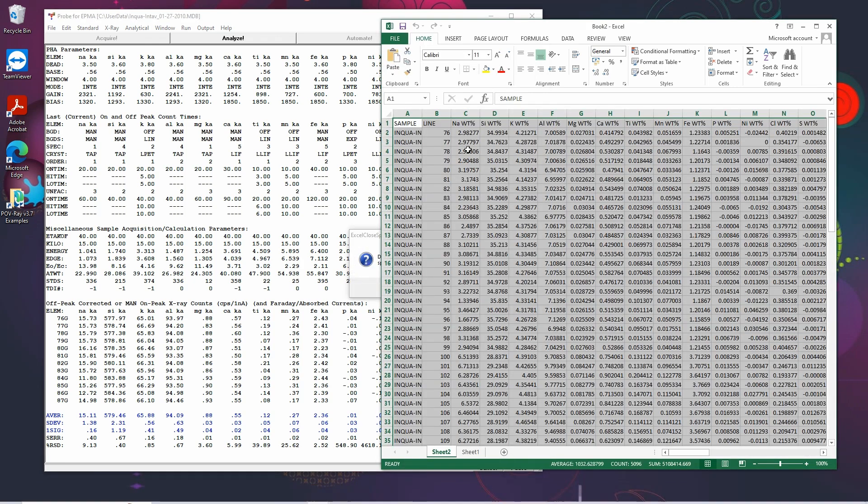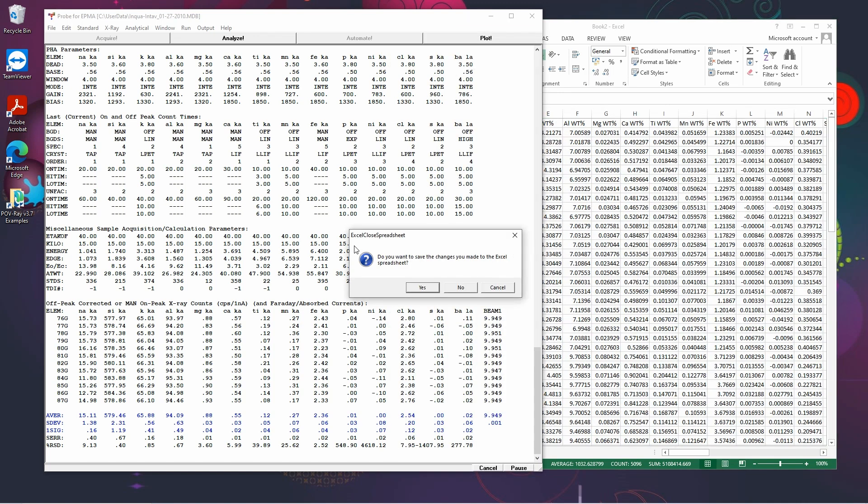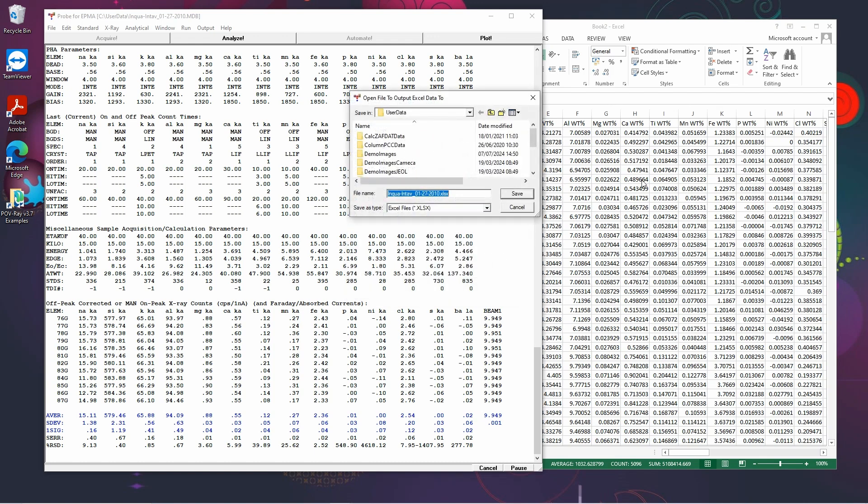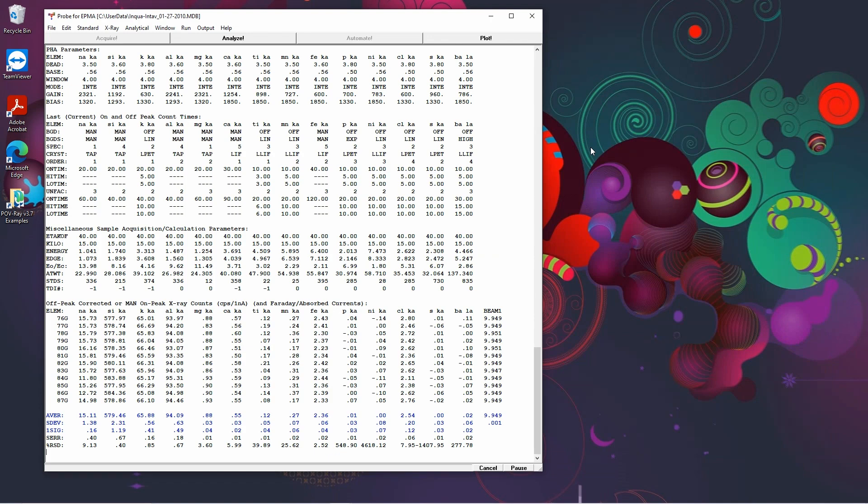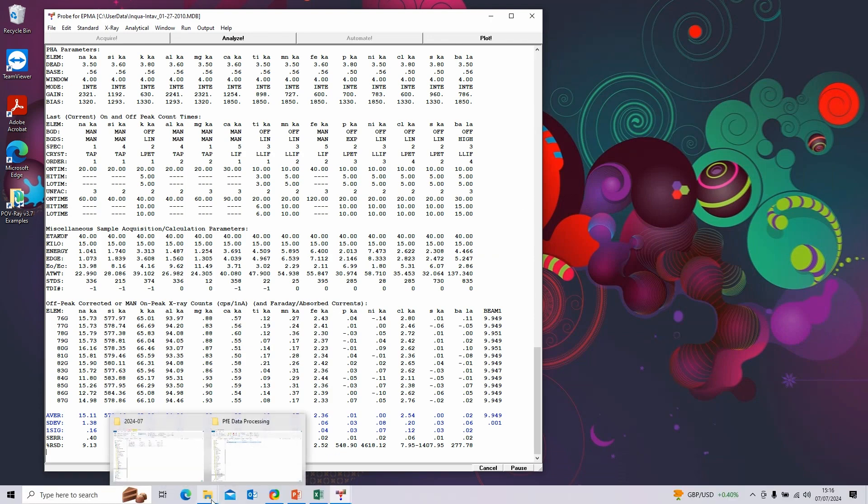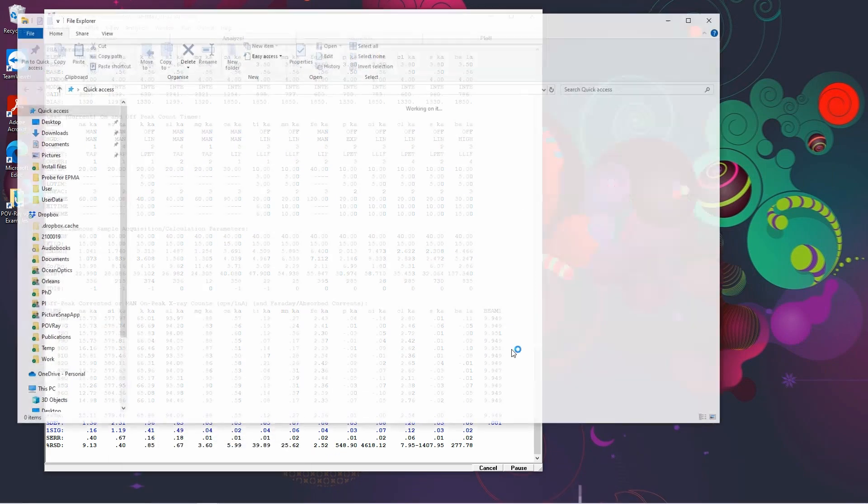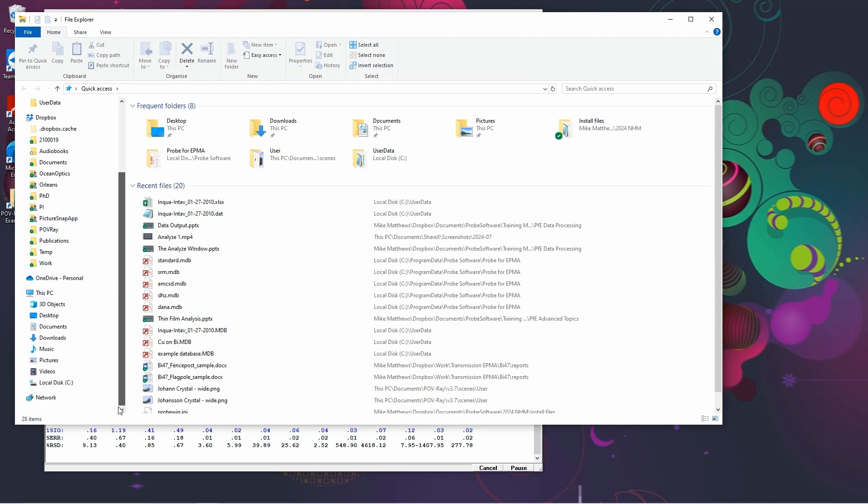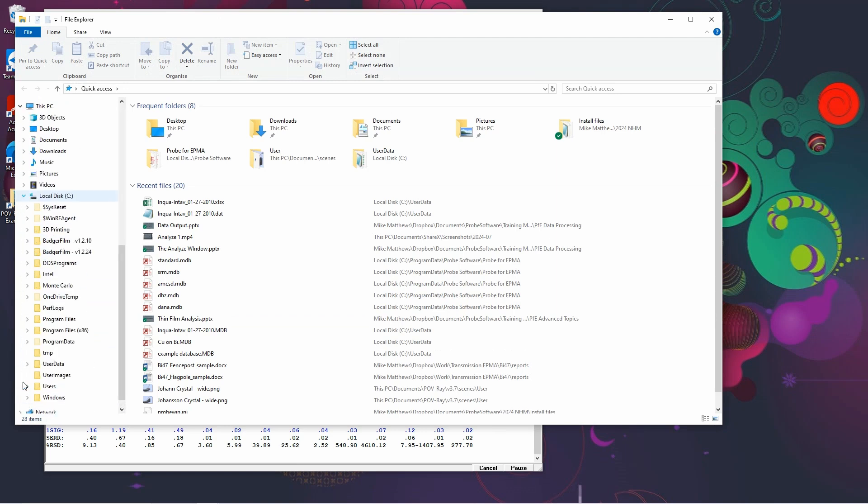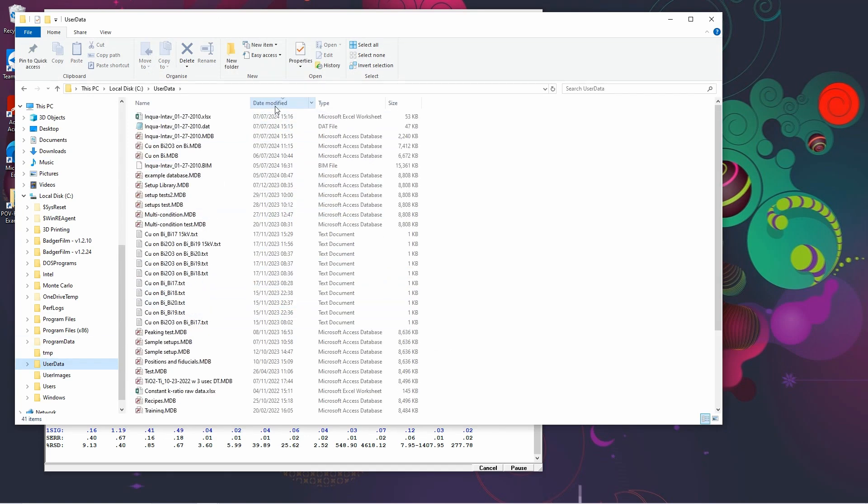It will open Excel and put all our data in. You'll see all of the sample data. Now strangely it asks you if you want to save the changes and it then closes Excel unhelpfully. So if you then go to user data.